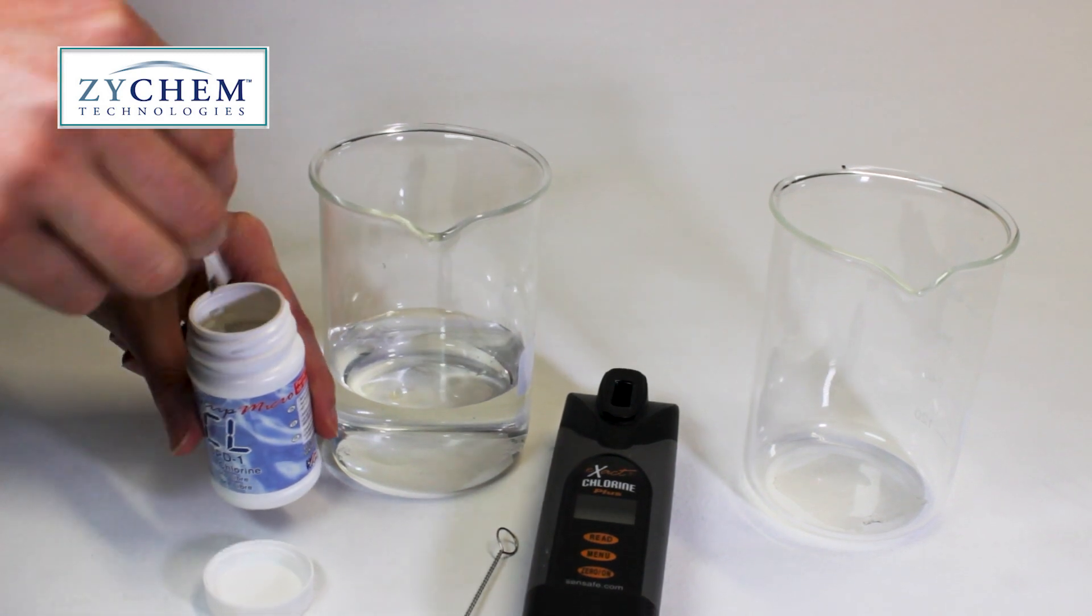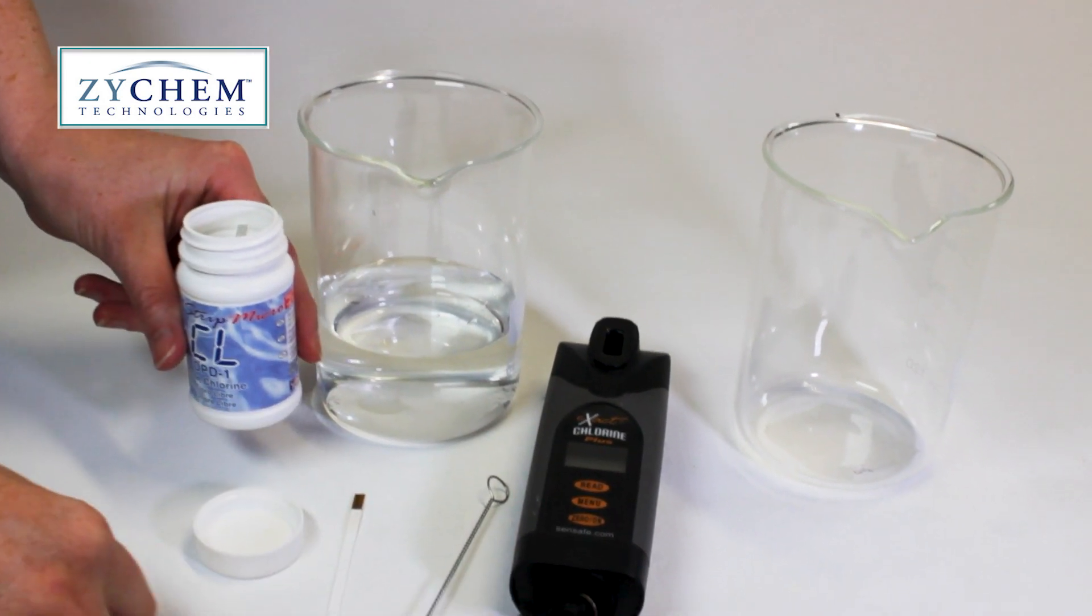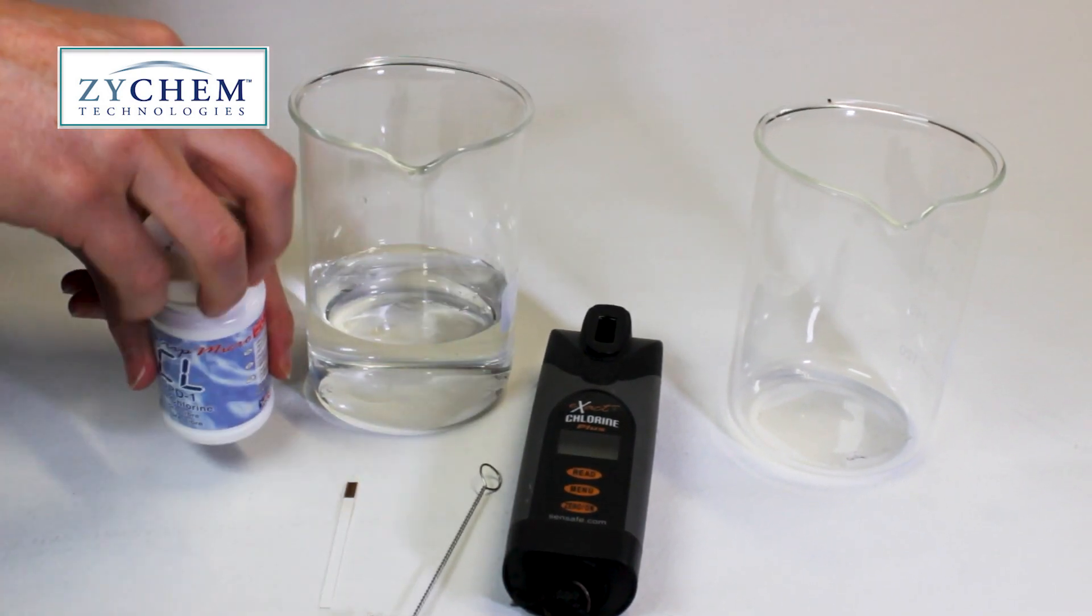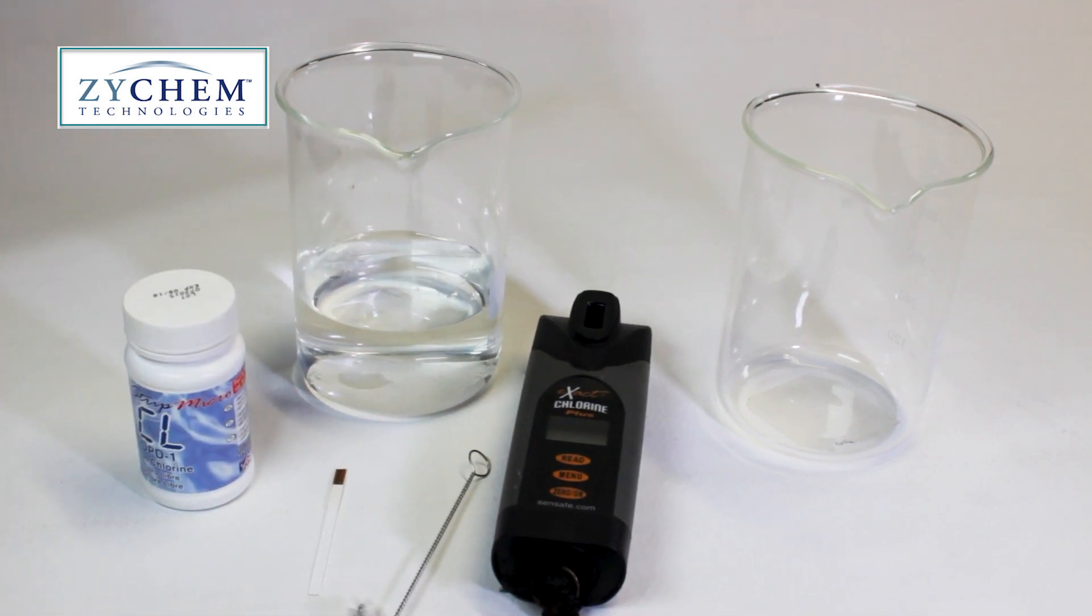First, take a DPD-1 strip out of the bottle and place it somewhere dry. Be sure to recap the bottle straight away. The test strips do best when they're kept away from light and moisture.